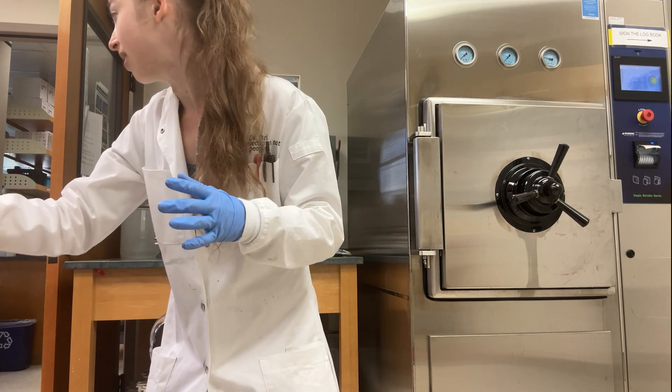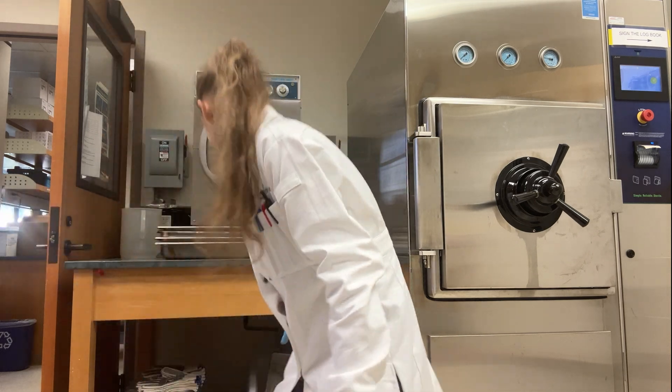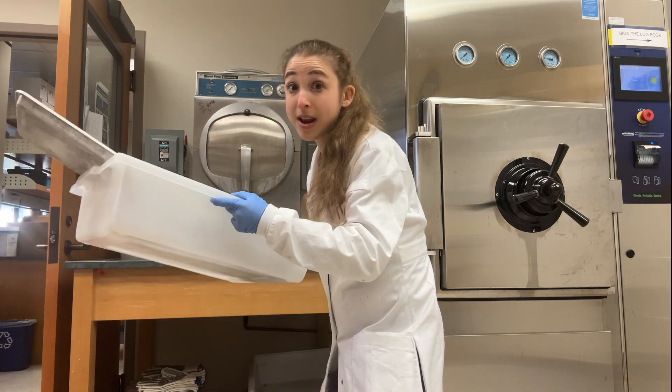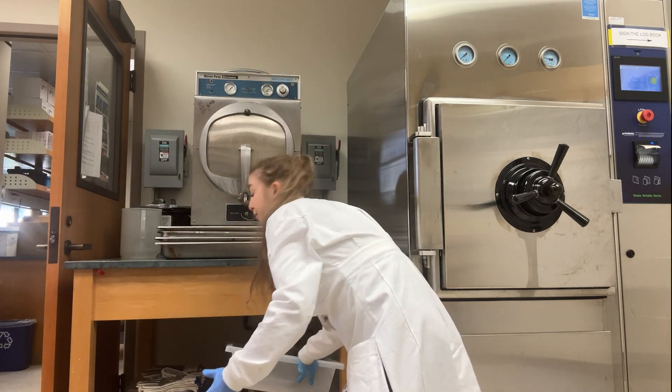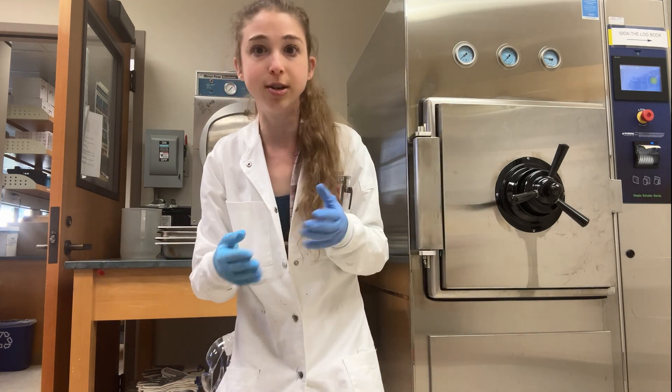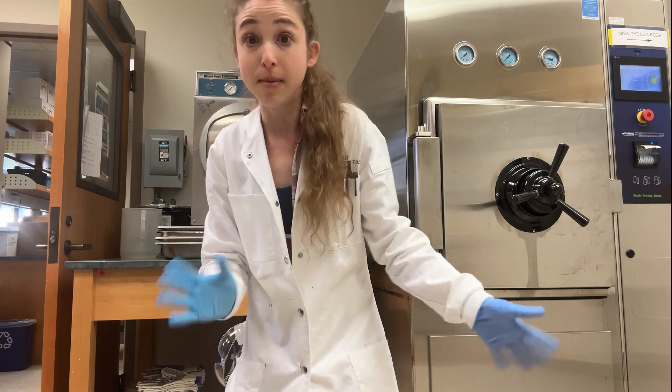When you stick things into the autoclave, you're often going to be putting them in some sort of autoclave tray. Make sure that whatever you put in the autoclave is autoclaveable — some plastics aren't autoclave safe — so be sure to look that up or else your stuff is going to melt all over.